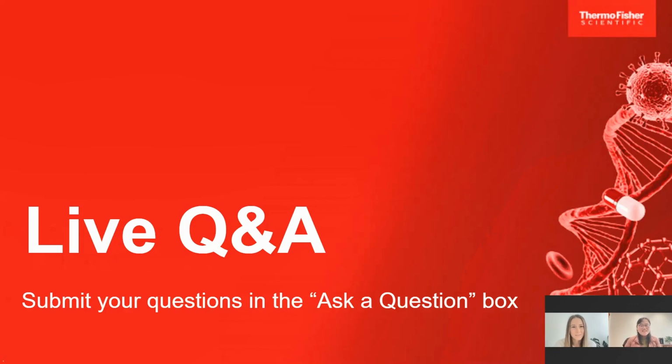Yeah, thank you. We have tried different concentration methods, and we found that the InnovaPrep and the Nanotrap hydrogel beads both have around 20% recovery of the virus pathogens. We did that by comparing the direct extraction and the concentrated pathogens. So my answer is that around 20% is what we found from the samples.